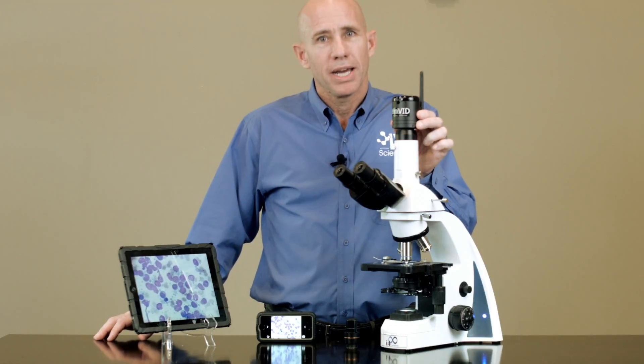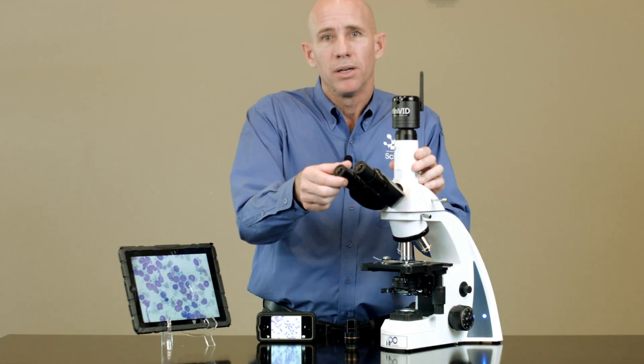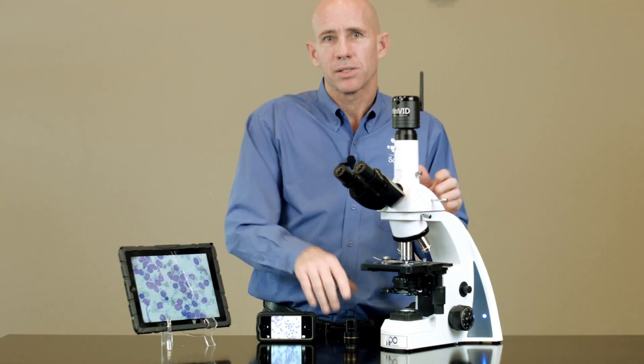Mount this 5 megapixel camera onto any trinocular head, or even into the eye tube of any microscope using the optional eye tube adapter, for instant images on multiple devices at the same time.